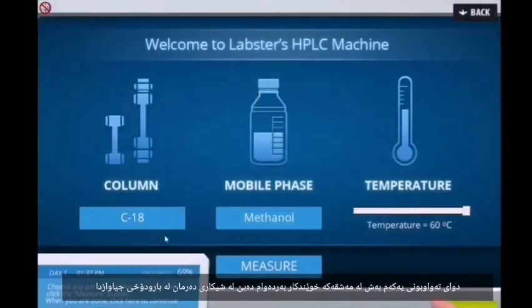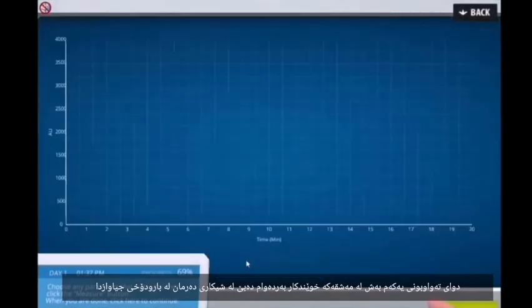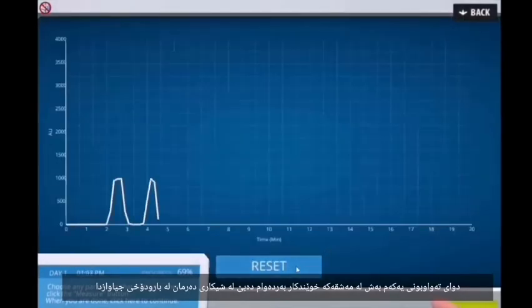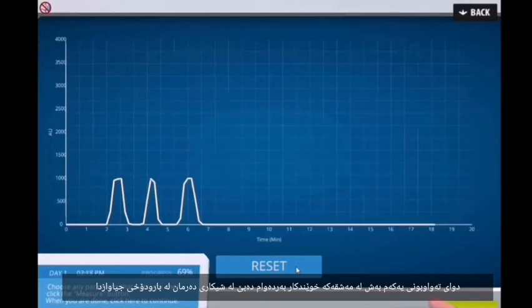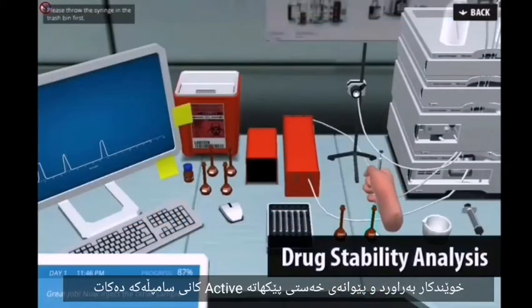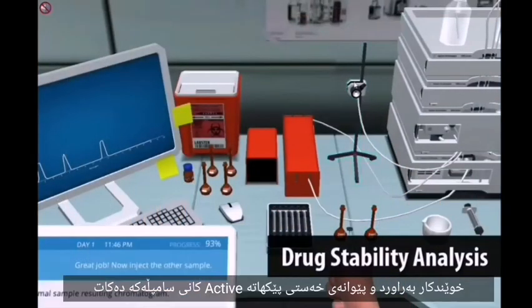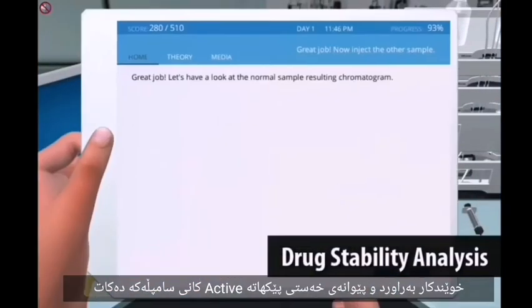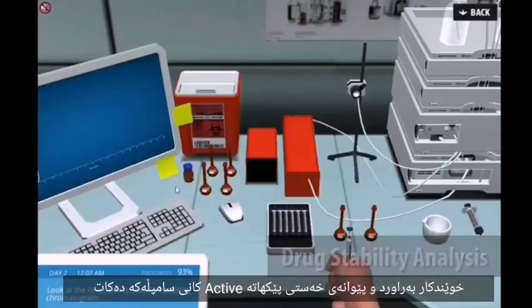After completing the first part of the exercise, students continue to analyze drugs that have been stored in different conditions. Students will measure and compare the active ingredient concentration.